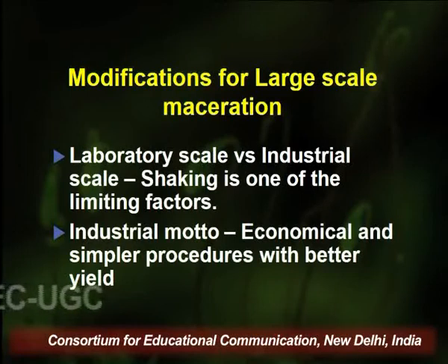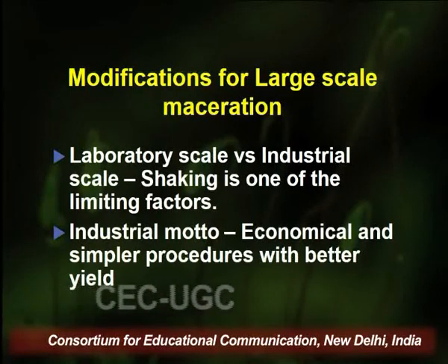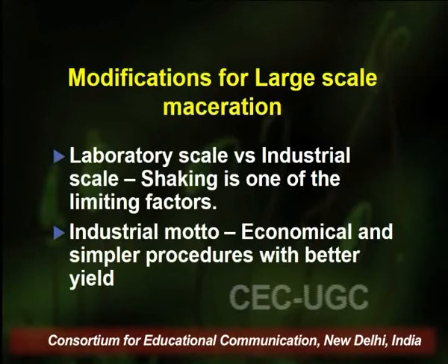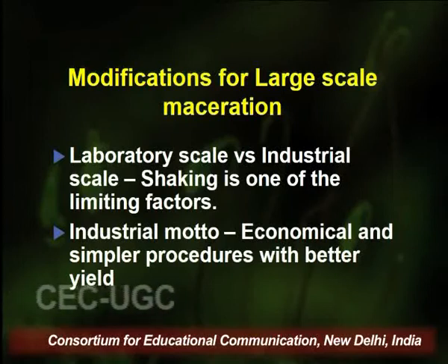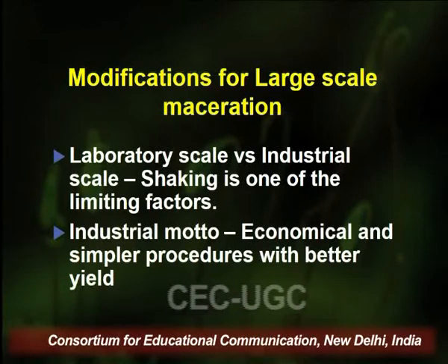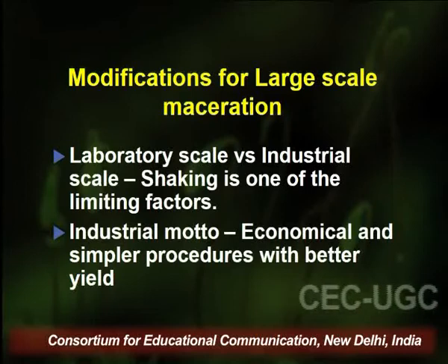One of the major problems is the shaking or the agitation that we provide at the laboratory scale, and when we have to shift that method up to the industrial level. Then further, whenever we are dealing with an extraction process in an industrial scenario, the process should be economical and it should provide a better yield.